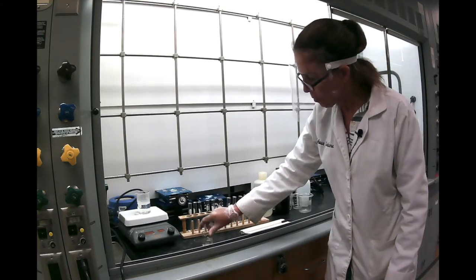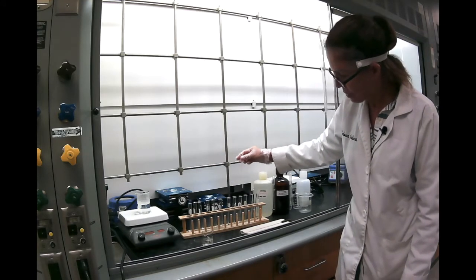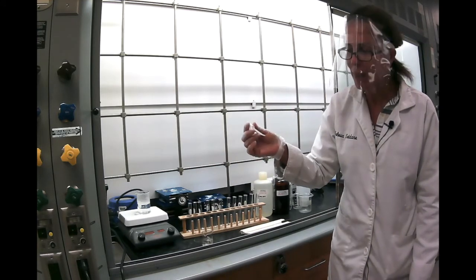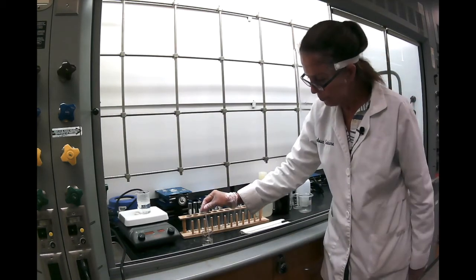My first solvent is going to be water. In the first sample of each substance, I'm going to put 1 milliliter of water, and 1 milliliter is about a pipette full.